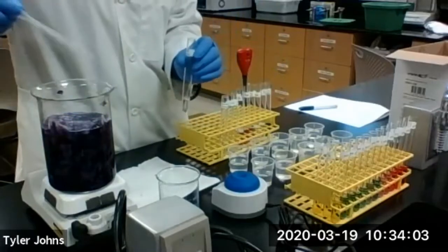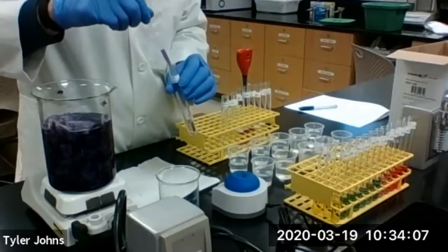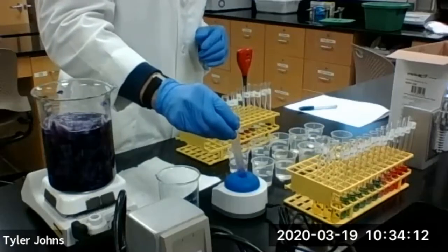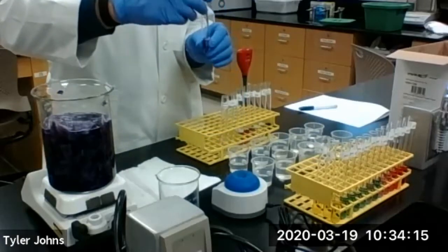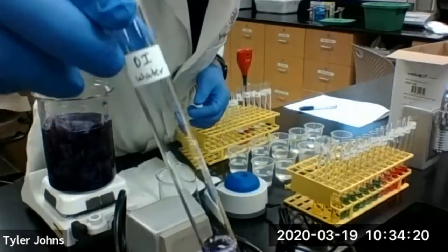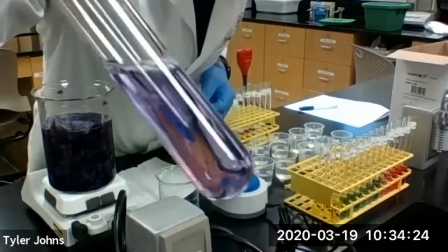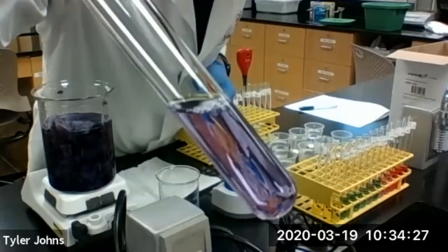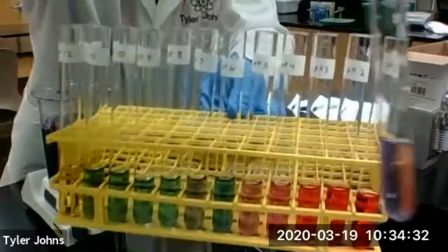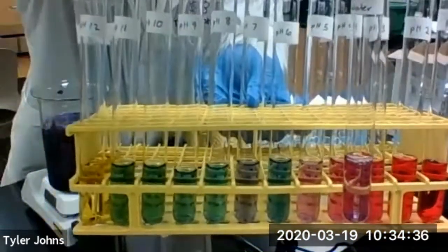Now we're going to test DI water, deionized water. Here's our deionized water. Compare to our references again.